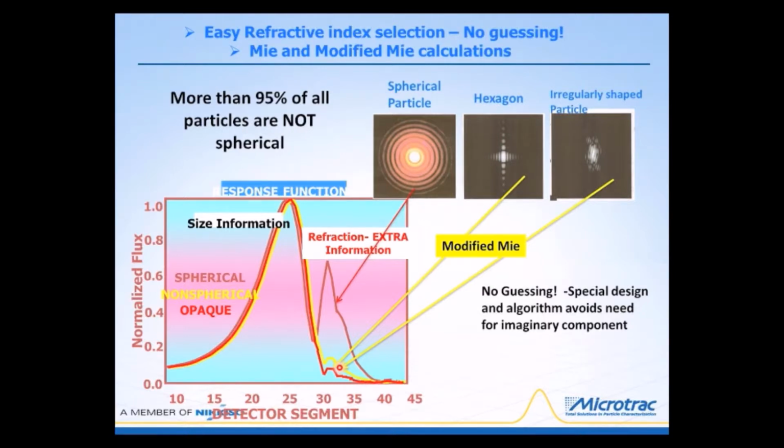So when we're asking for irregularly shaped particles, this is the type of thing that we're dealing with. This provides the best starting point for the calculations going from our fingerprint of the signal pattern to the particle size. Now, in Microtrac instruments, materials that are considered opaque, and we're showing this down here, opaque particles, meaning black or dark blue or something like that, tend to absorb an awful lot of light. This is the pattern here.